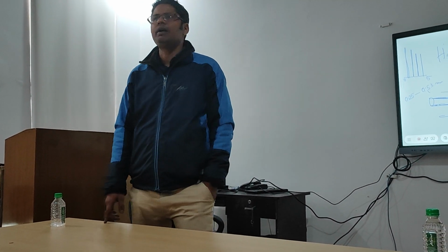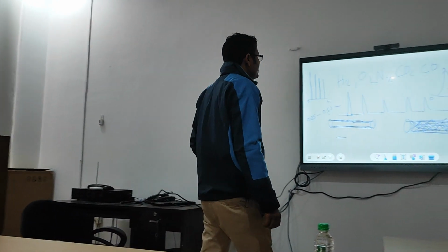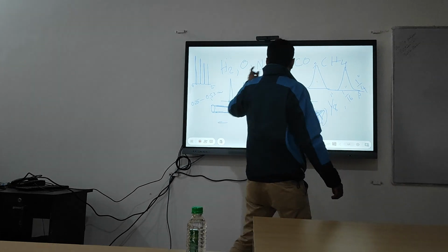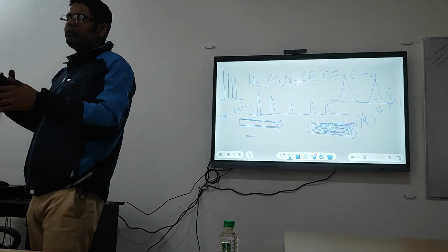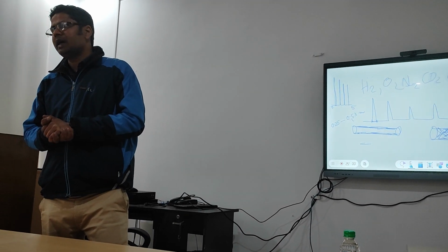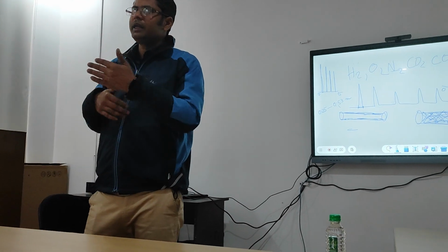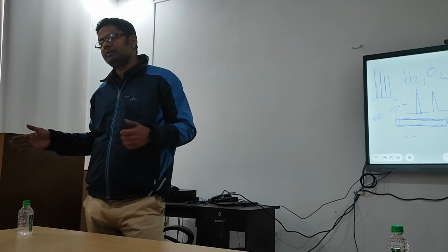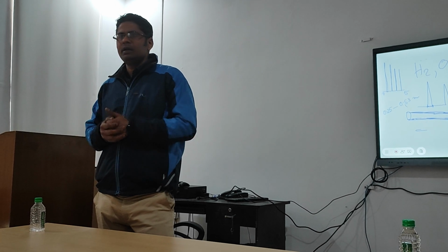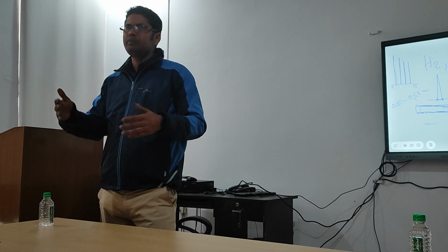In this detector, you can get only hydrocarbon peaks. So if your sample contains any hydrocarbon, it will be detected in FID. If you inject a mixture into any column, that mixture will be separated, right? But after the column, a detector should detect, otherwise you will not get the peak. The column's purpose is separation and the detector's purpose is detection. After separation, it should detect all the components one by one at different times, so that you get all the components' representation. Peak is the component's representation.